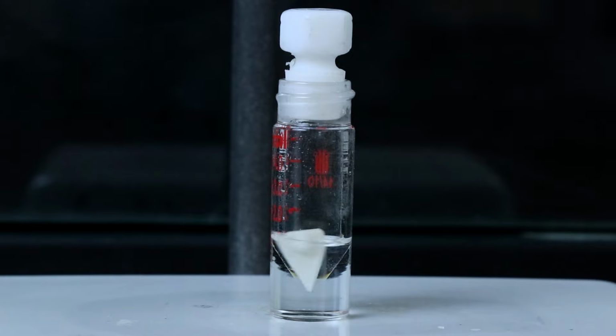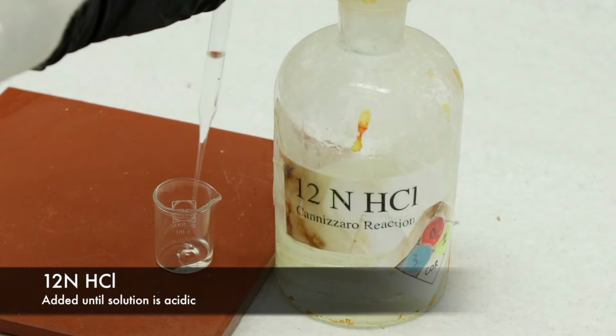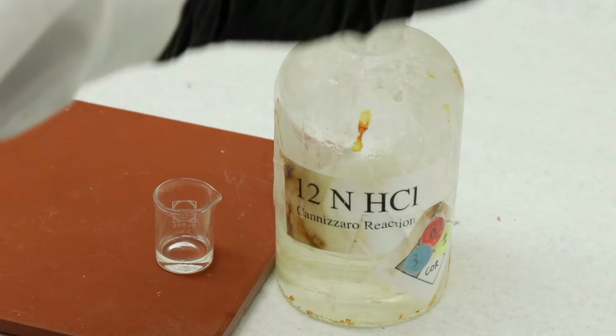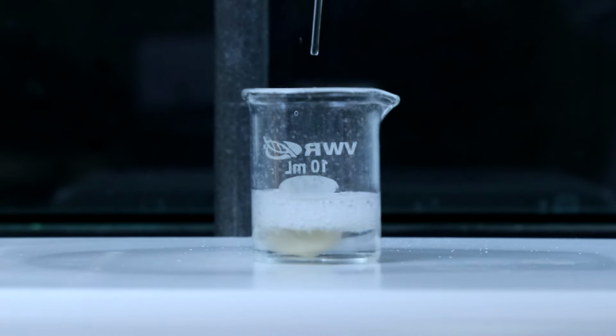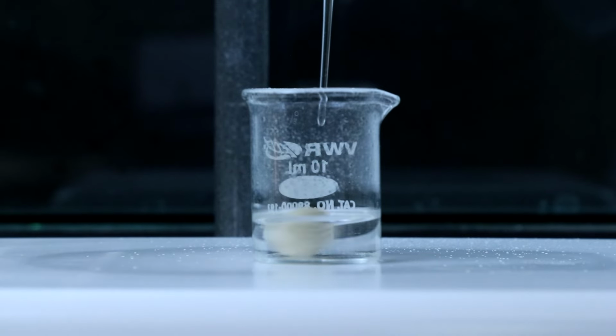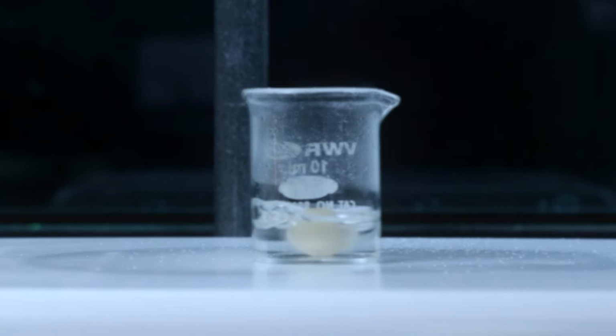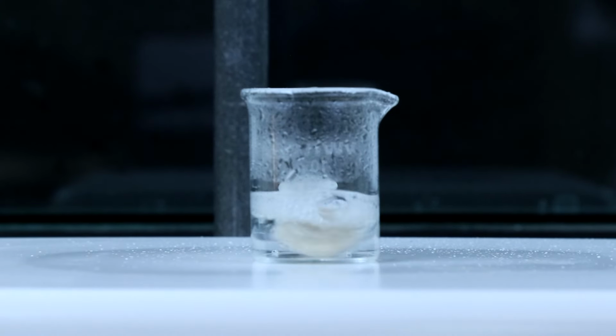While that's going, I'm going to go ahead and start working on the unknown acid. So I'll get the 12 normal hydrochloric acid to begin neutralizing the solution, and I'll add that until the solution is acidic. You can see the CO2 bubbles coming off as the hydrochloric acid reacts with the remaining sodium bicarb. And remember that we want to be stirring this really well so that the hydrochloric acid is able to react with everything in there.